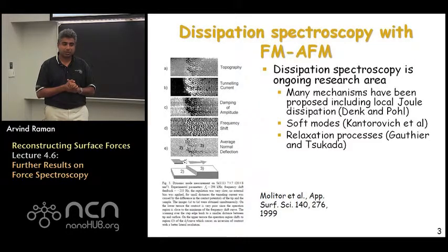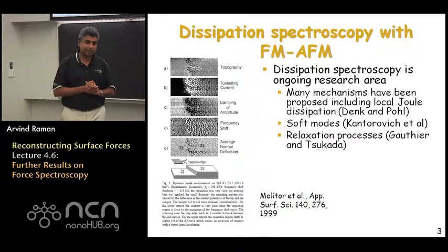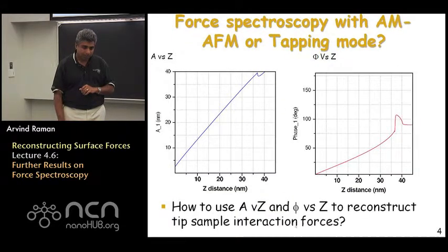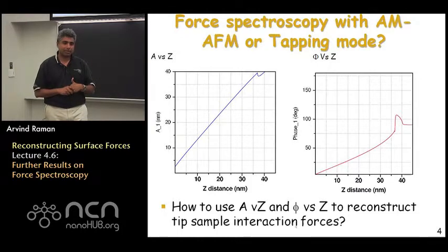ongoing area of research. I just wanted to bring it up because we haven't really talked about dissipation spectroscopy in FM-AFM in this class so far, but it is an important subject, an ongoing area of research, and again, we hope to see more results coming out in this area in the future. So I want to turn my attention to tapping mode AFM again.